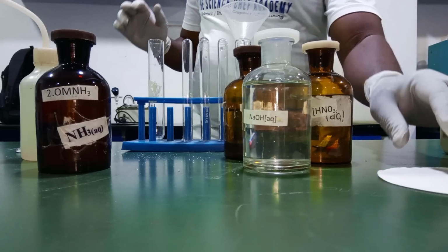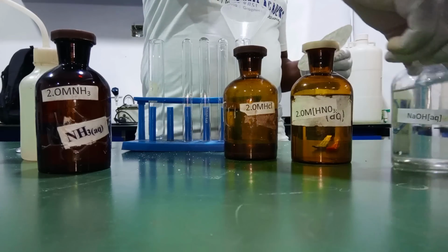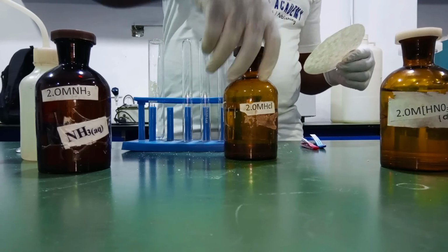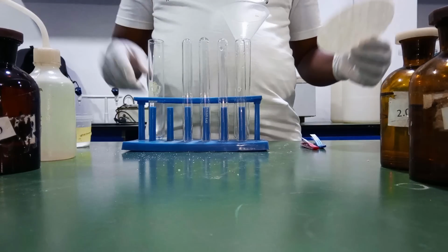So the next thing is to fold a filter paper. So let's keep it aside so you can see what you're doing. The next thing is to fold a filter paper.